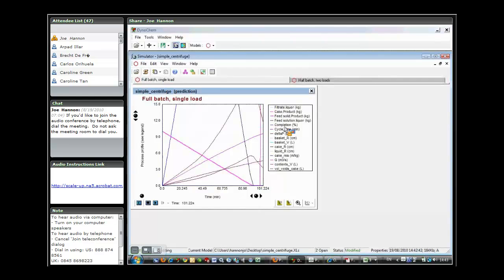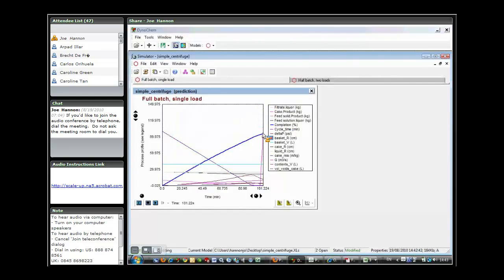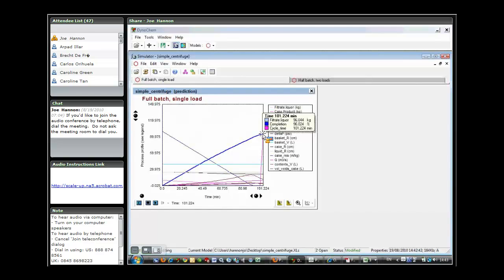There's a variable here called completion, which really looks at the proportion of the material, the total amount of material that we want to filter that has already ended up in the cake. You can think about that a little bit like a conversion-type calculation for a reaction. If we've managed to feed all the material and it's ended up in the cake, then we'll have a high score for completion.